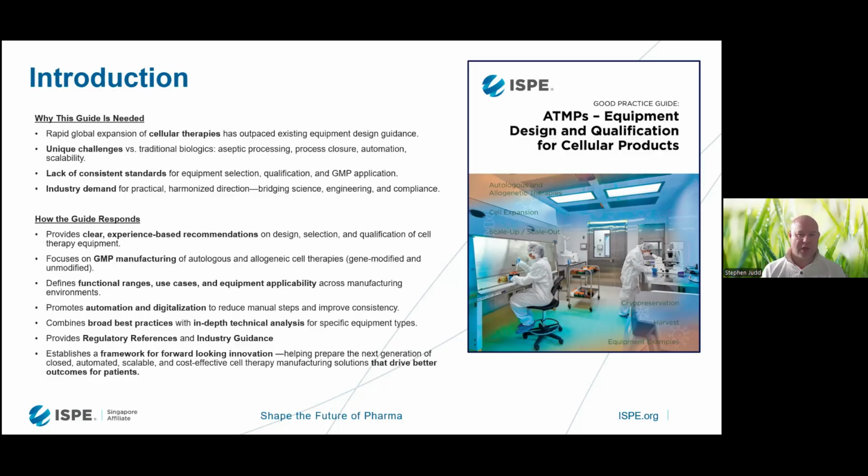So we can't talk about, say, bioreactors in general terms. We need to talk about specific equipment because the equipment is quite specific to the specific unit operations associated with this sector. One thing I would like to highlight, though, is that the information provided is for general information only to guide the reader's decision making process when it comes to the approaches that you would like to take.